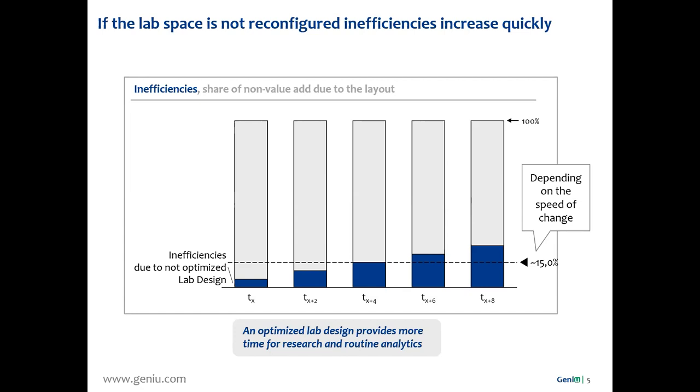And so if you don't act and just keep everything as it is, without adjusting it properly, then you will definitely have inefficiencies there. So the key thing is, if you are thinking about redesigning a laboratory, you should definitely think about lean lab techniques, because with this you can reduce these inefficiencies, and you can also address quite some inefficiencies without building a new lab, just by redesigning the equipment locations. That's also what you should do or can do.